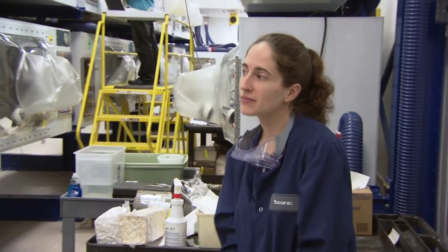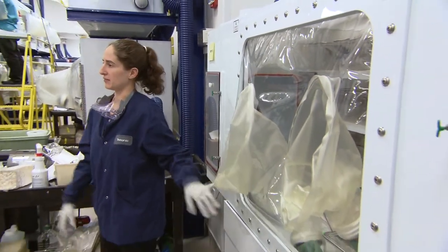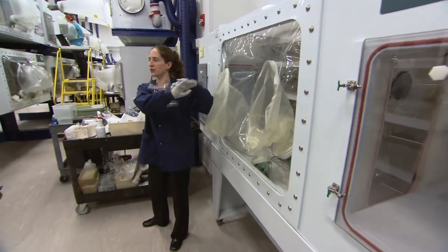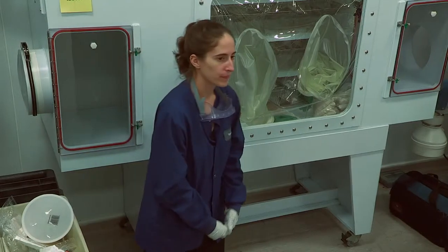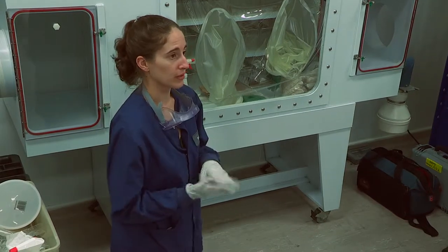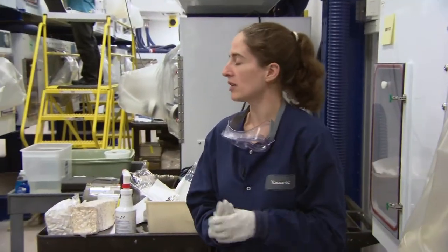I'm just curious — in the initial setup of the isolators, do you transport each clean cage into the isolator similar to what you've shown us? What they'll do when they reprocess the isolator is take the front off, inspect it, and check the filters. They'll set up all the cages and feeders before they do the cold sterilization — so it's not one at a time. If we had to add additional cages, that would be one at a time sprayed through the floor. Do they go in wrapped? When we put them in, no — they would get cleaned, then autoclaved, then go in. So they're not autoclaved individually or wrapped individually — and then the cold sterilization.